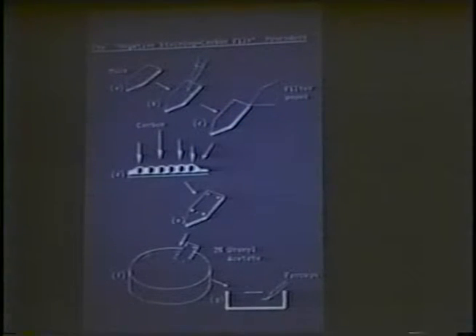After drying, the strips of mica are coated with a thin layer of carbon, and the corners of the mica are then marked with a water-insoluble black fiber tip pen. The thin film of carbon, together with adsorbed single protein molecules and two-dimensional crystals, is then floated off on the surface of 2% uranyl acetate. The thin carbon film is almost invisible, but is revealed by the black pen marks.